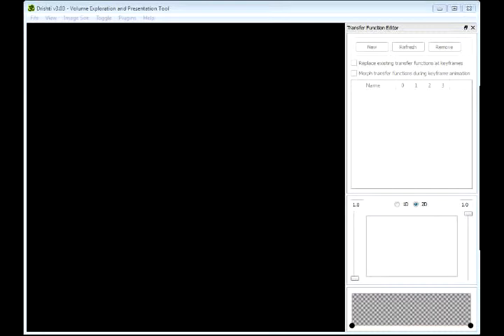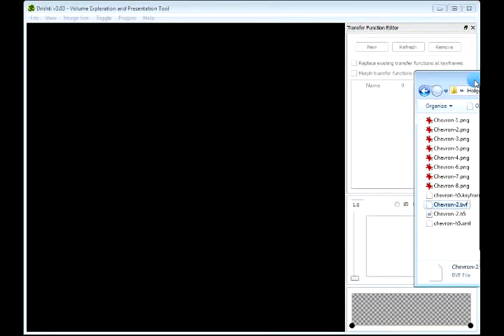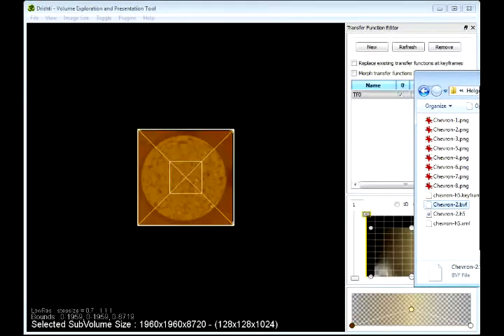In this video I will show you how to use the slices functionality and the isosurface functionality for pre-release Drishti 3. The slices functionality shows clipping planes as textured slices, textured using the transfer functions from set 0, and the isosurface functionality shows the raycasted isosurface. So let's drag and drop this volume here.